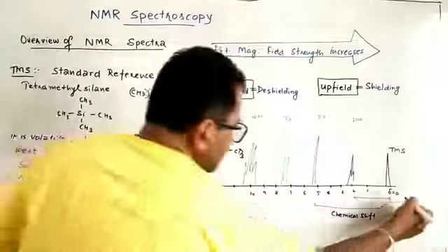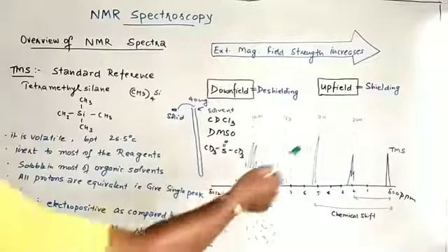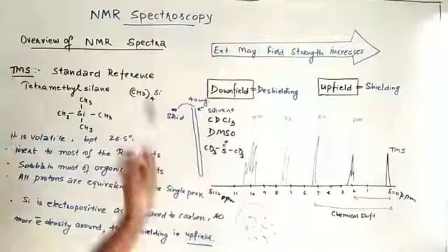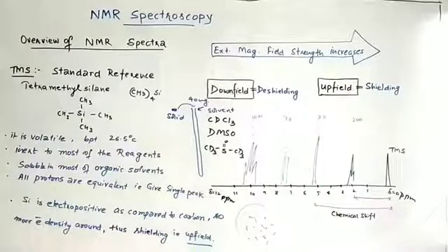Here we can write 0 ppm, parts per million. So this is a chemical shift, like 2.001 is the chemical shift for the first peak, and 5.11 is the chemical shift for the second peak. Peaks may differ, like you can see here, their height may be different. The splitting is also different: split into 3, single with no splitting, split into 2, split into 4. There are some factors which cause this splitting or separation of peaks from one another.